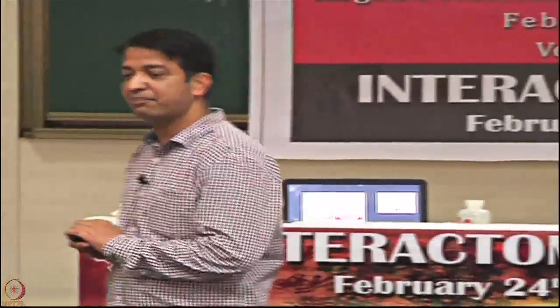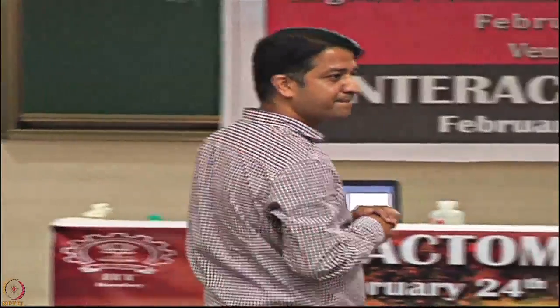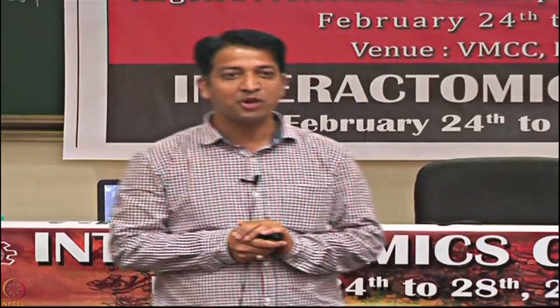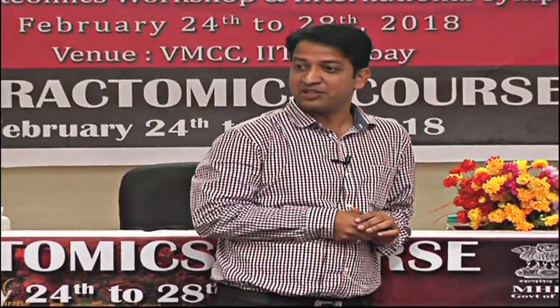Great. So, the right answer is throughput, right. Any idea how long the first human genome took to get sequenced? 10 years. It took 10 years, and almost how many million dollars were invested? Almost $3 billion was invested for the first human genome to be sequenced.